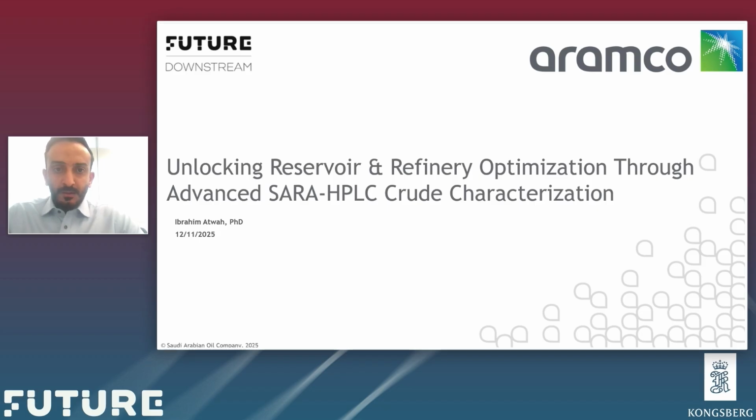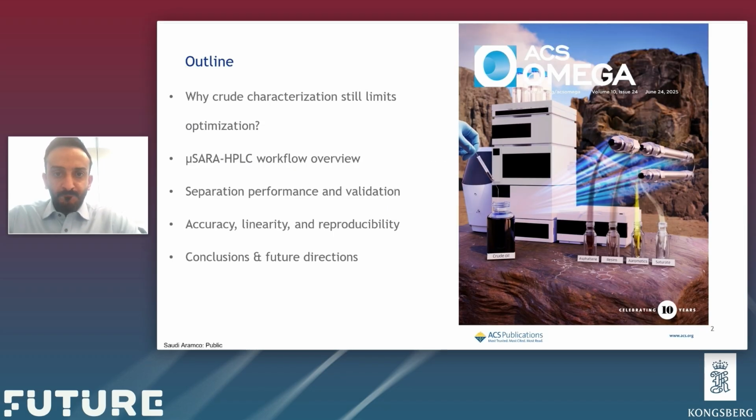So the outline for my presentation is as follows. This is the flow that I will walk you through today. I'll start by framing why crude characterization, especially SARA, still creates bottlenecks in both reservoir and refinery workflows. Then I'll introduce the micro SARA-HPLC system, what we changed, why it works, and how it removes many of the limitations found in traditional methods.